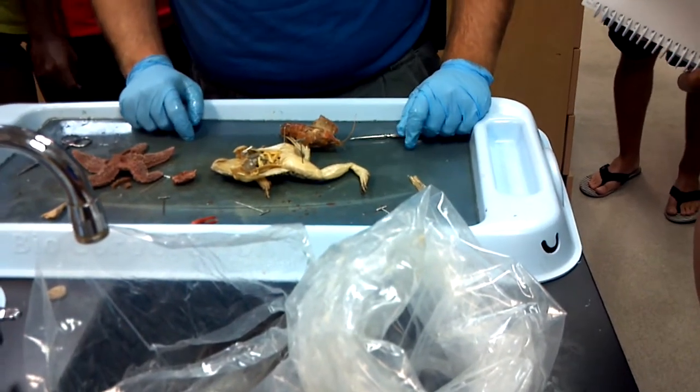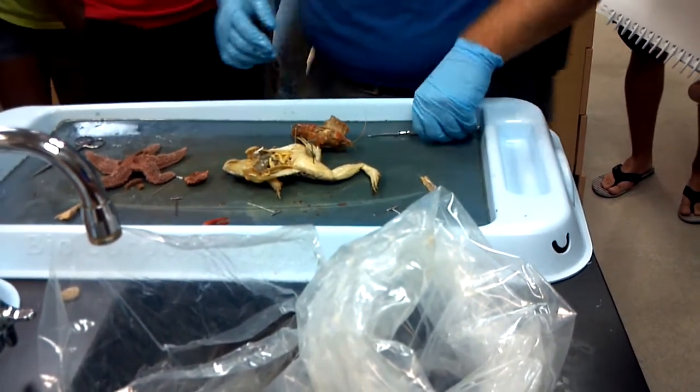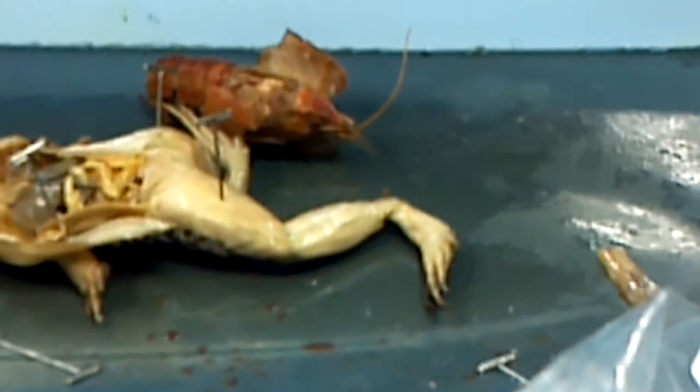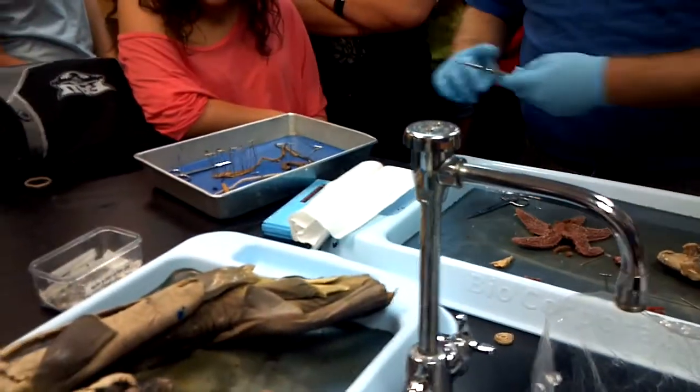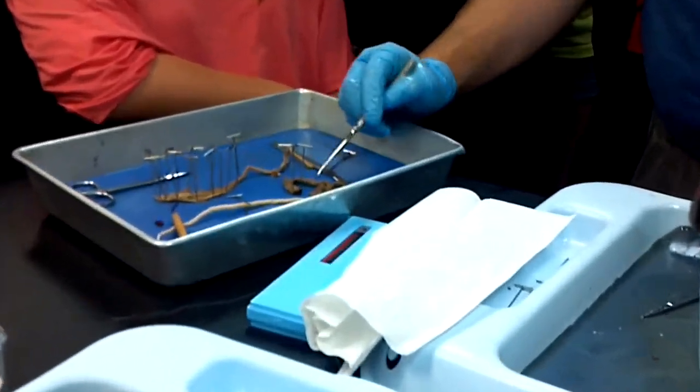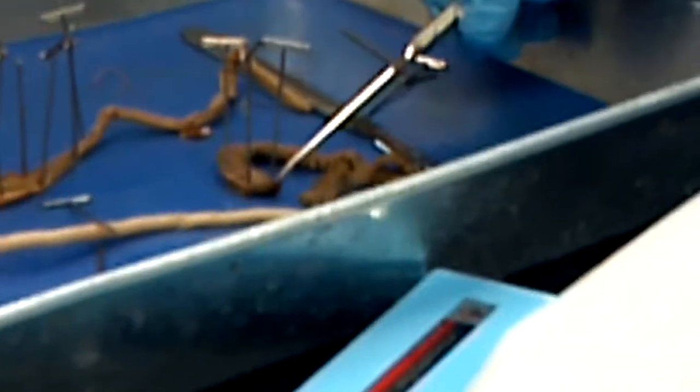We'll go over to the earthworm. I have the clamworm, which only has essentially a pharynx — which is right here. It's very muscular, and that's attached to its extendable jaws there.